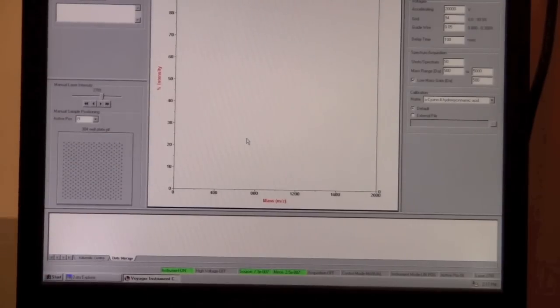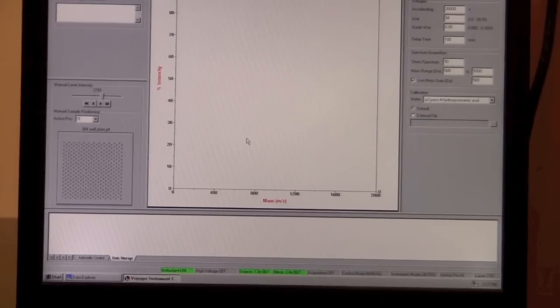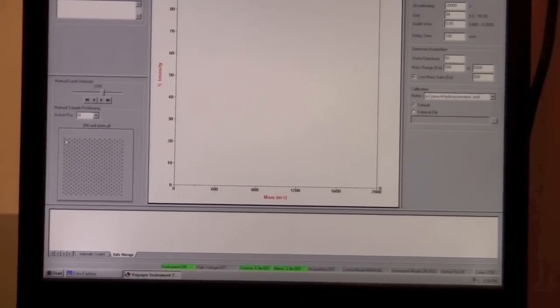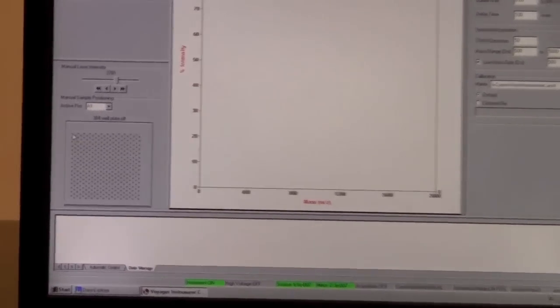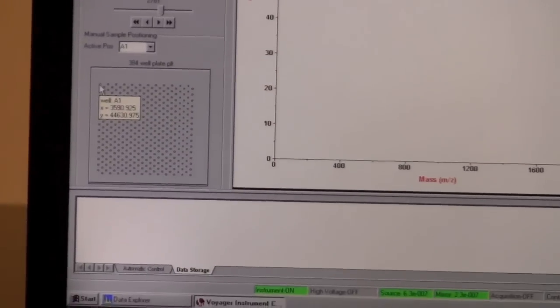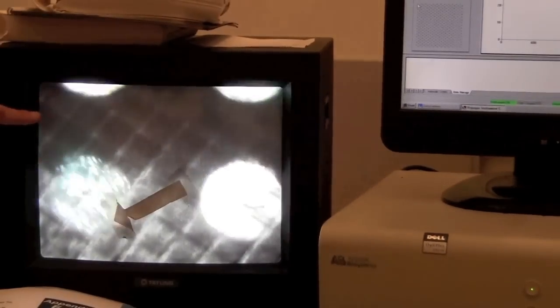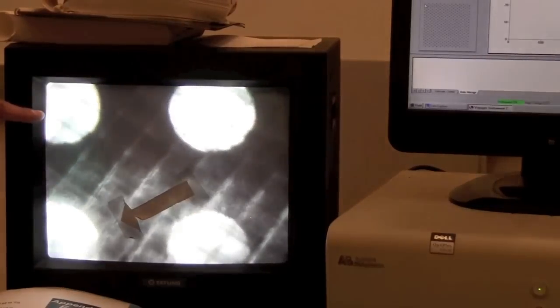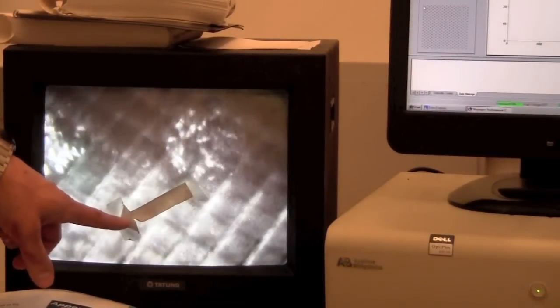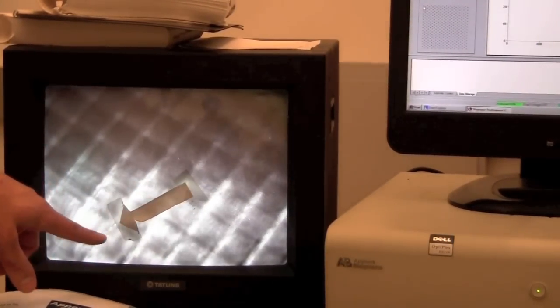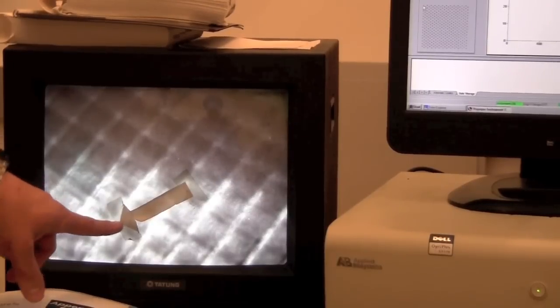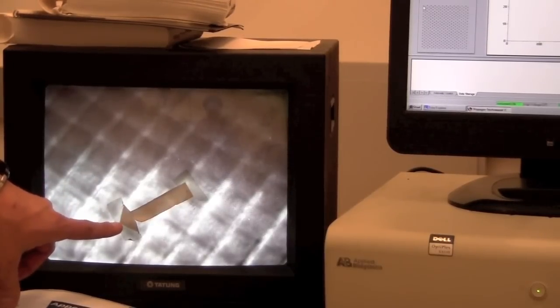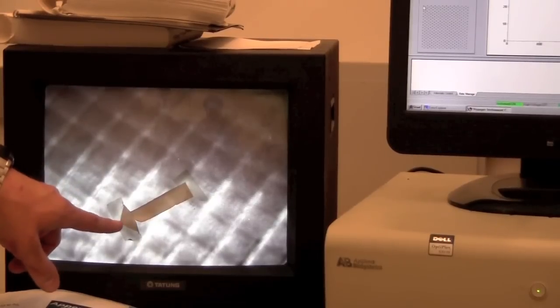In this case, it's loaded okay. So the next thing we want to do is move to where our sample is spotted on the plate. This diagram here can help us locate where it is. So if I click on a location on this diagram, it will automatically move the plate to be close to where the sample is. You can see on the monitor here that it's moving the plate. On the monitor, we have this arrow here which indicates where the MALDI laser is aimed. So that's the part of your sample that will actually be detected. That's where the laser is focused.